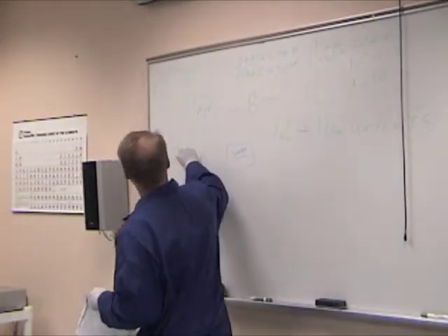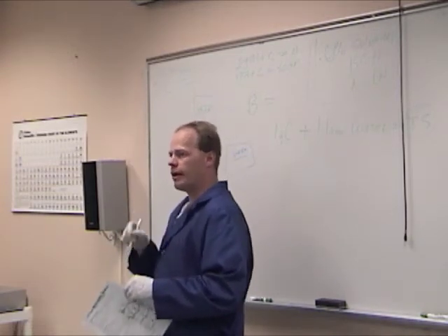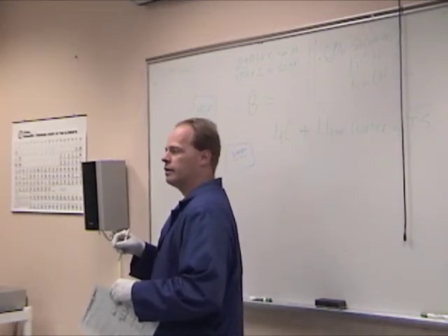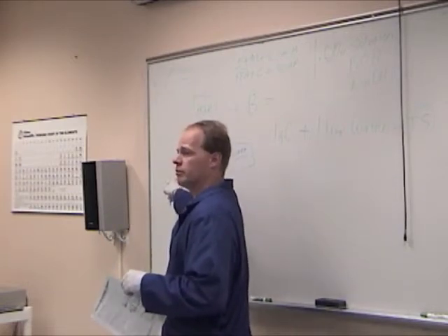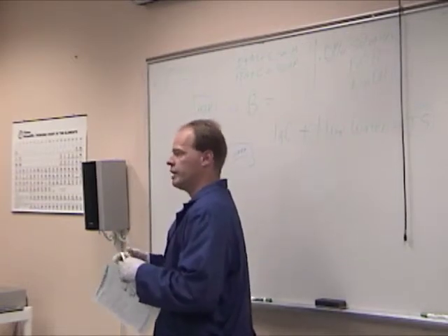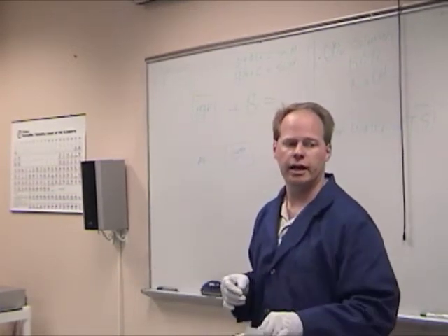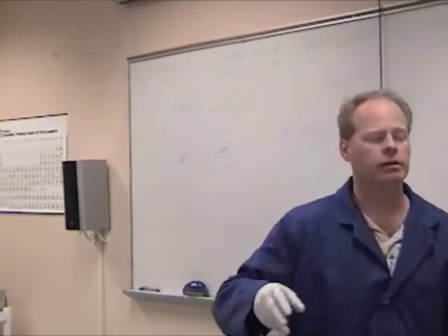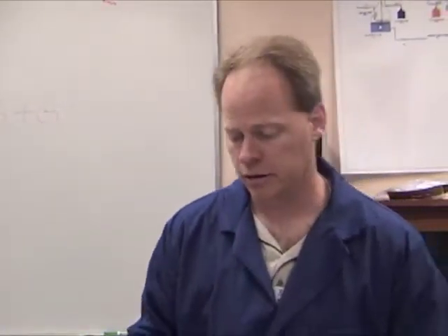One important thing, and I don't know that I've got it written down here, is never, ever, ever draw with a syringe from your source container. The reason for that is you don't want to contaminate it. So this titration solution that we've made up, we're going to put in one of these. Actually, we could put it in here and slosh this around. I'm going to pour that in.